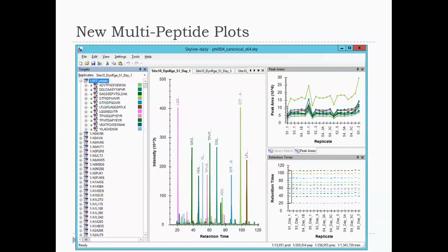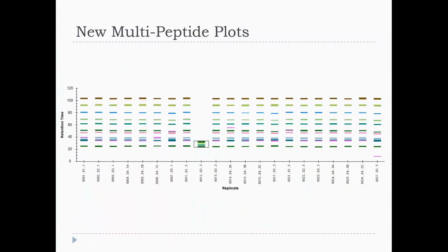This is the study that we've heard about, the 229 for one site, site 10. You can see that this is stuff that's all supposed to be consistent. And you can see that even in the IRT peptides, there's some weird variance in the peak areas, right at a glance. And then here you can feel happy that your IRTs are all pretty well lining up over the 21 runs.